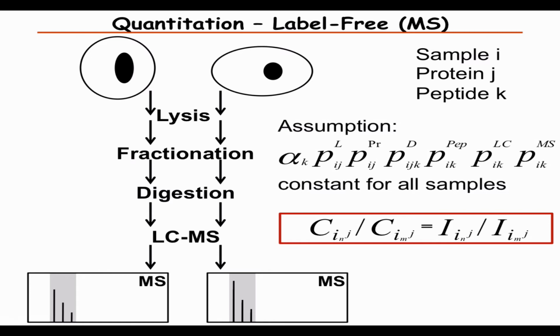And it's still a discussion of how to combine these different measurements from the same protein in a good way. So sometimes you can explain why a peptide should be an outlier. Let's say it has a post-translational modification in some cases, that would, of course, give rise to an outlier.